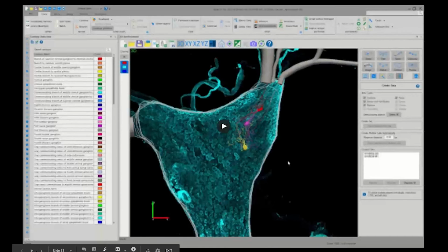Nice. Thanks for demonstrating that. The flexibility of the new branch naming with SciCrunch terms looks very useful. Now I want to show you another tool that has recently been connected to the SciCrunch terminology database.